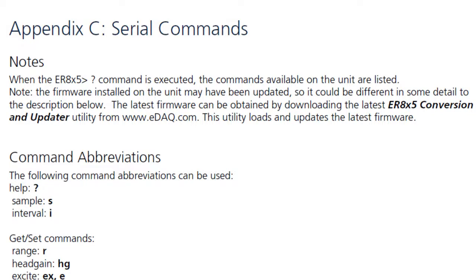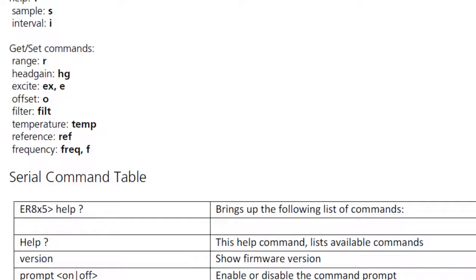The software provides a simple alternative to using direct serial commands as shown here in the manual.